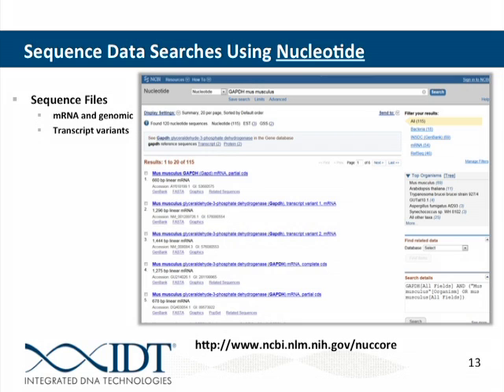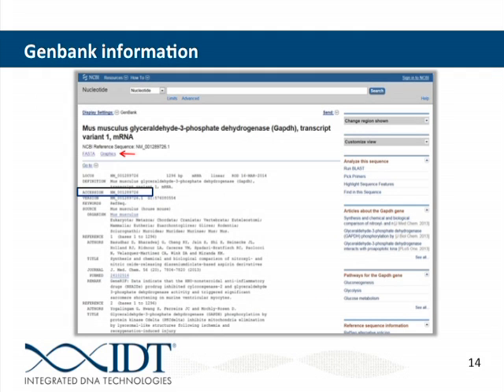And what it will provide for you is your sequence of interest. Here's the unique accession number. It tells you a little bit about this gene and some of the references associated with it. But then you can also obtain the FASTA sequence in an easy, accessible form that's easy to put into other programs and manipulate for other applications.